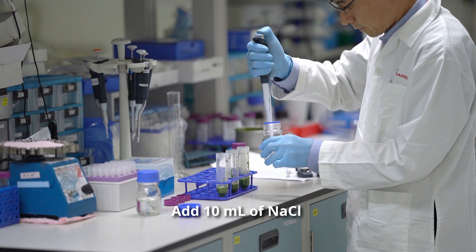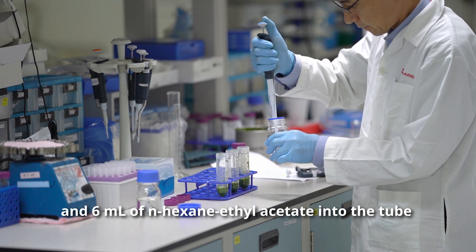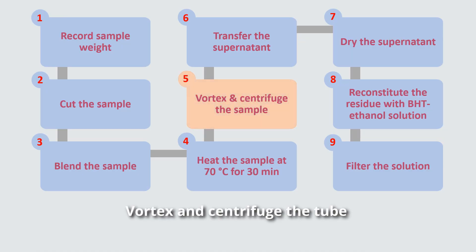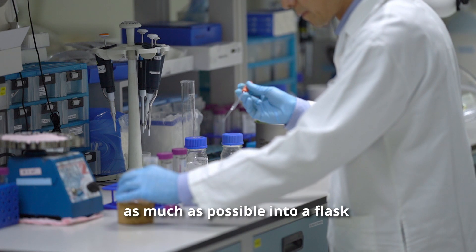Add 10 ml of sodium chloride and 6 ml of hexane ethyl acetate into the tube. Vortex and centrifuge the tube. After that, transfer the supernatant as much as possible into a flask.